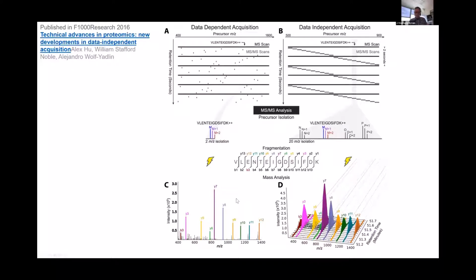But with the data, I like the data analysis from a DIA experiment a lot better. It tends to have a nice quantitation data set. One of the challenges with DIA is we don't always get the depth from a DIA experiment that we would from a TMT. So again, it depends on what your ultimate goal is. Do you really need to get more proteins identified? What are your samples? What's your experimental design, to know what's going to be the best approach?